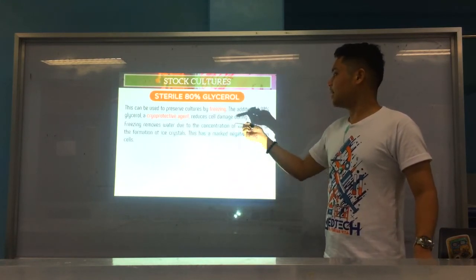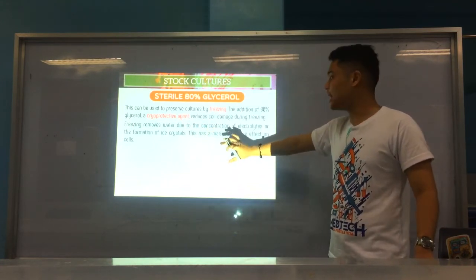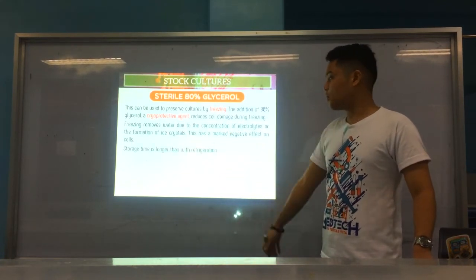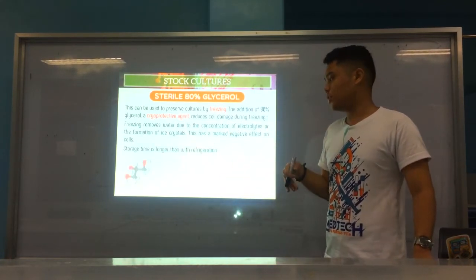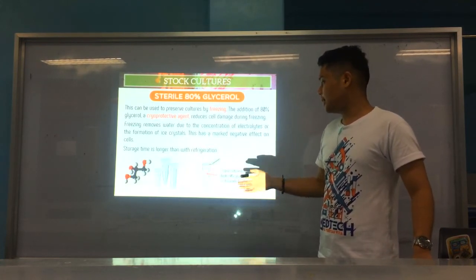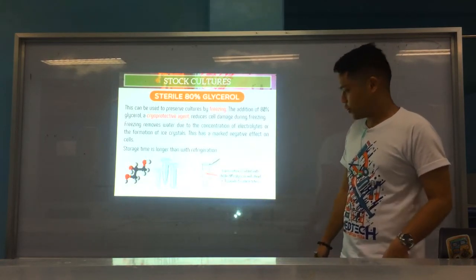And freezing again removes water, and due to the formation of ice crystals, it can have a negative effect on the cells. So it's longer siya than with refrigeration. So again, we use usually these conical tubes. Alright, liquid culture na may butangan na tayo o sterile 80% glycerol.